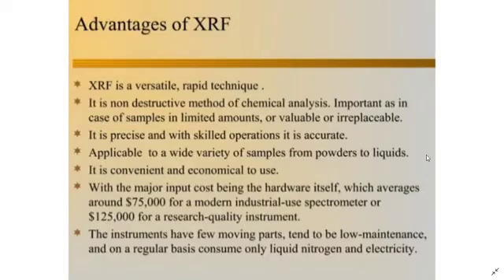And this is how the patterns look. So, the advantages of XRF: XRF is a versatile, rapid technique. It is a non-destructive method of chemical analysis, important in the case of samples in limited amounts or valuable or irreplaceable. It is precise with a skilled operator. It is accurate, applicable to a wide variety of samples from powders to liquids.